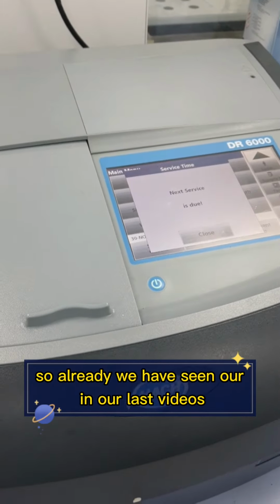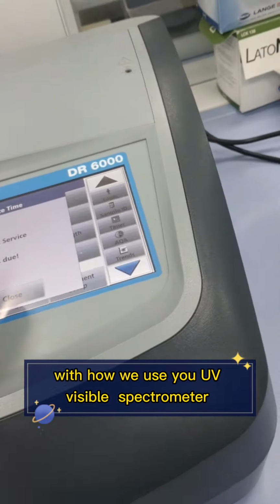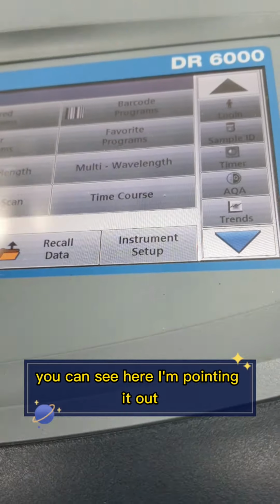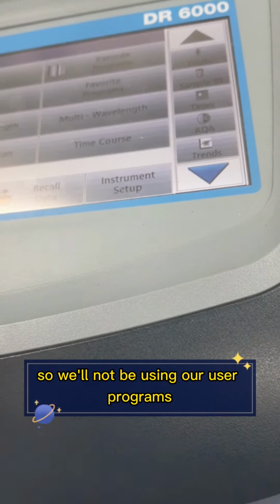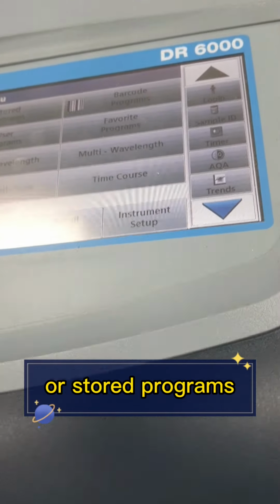So already we have seen in our last videos how we use the UV visible spectrophotometer. So here we're going to use barcode programs. You can see here I'm pointing it out. We will not be using our user programs or stored programs, we will just be using the barcode.